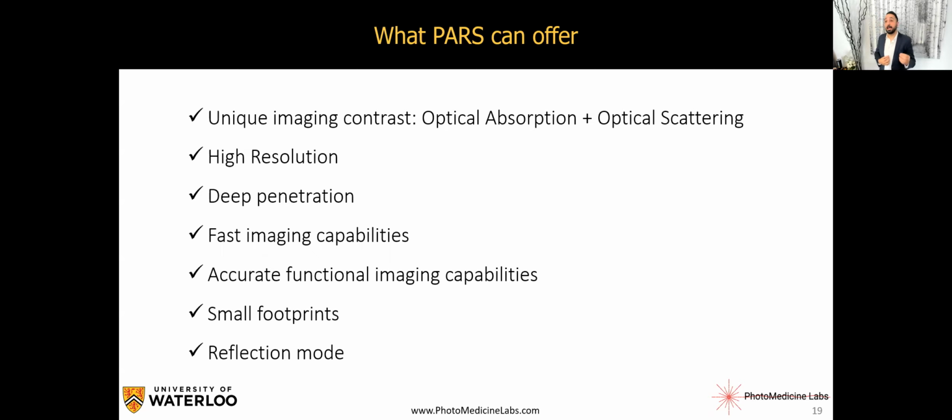Because we have this very unique detection laser, in some cases we actually care about the fact that our detection laser also gets absorbed by the target, but let's ignore that and imagine we want to increase the penetration depth. We can select our detection wavelength to be a long penetrating wavelength.